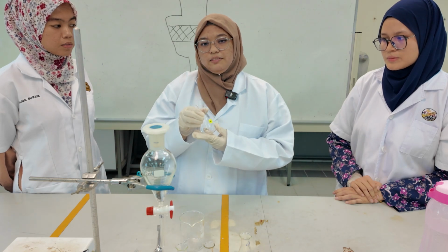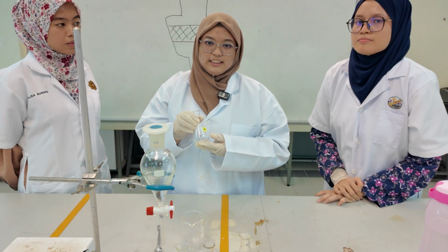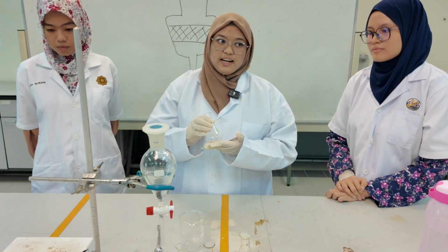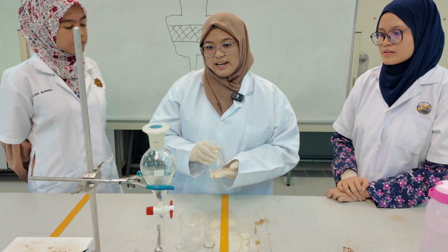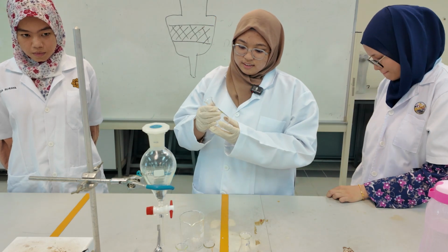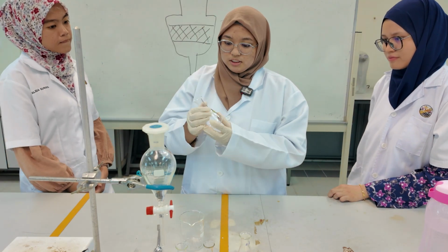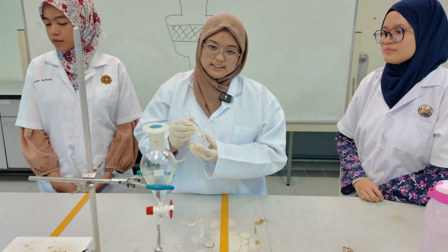After we've added all the compounds, we need to dissolve them with DCM. We'll be dissolving them with 10 milliliters of DCM, and make sure everything has been dissolved. We just want all liquids. Once everything has been dissolved, we will move on to the first extraction, which is the acid extraction.